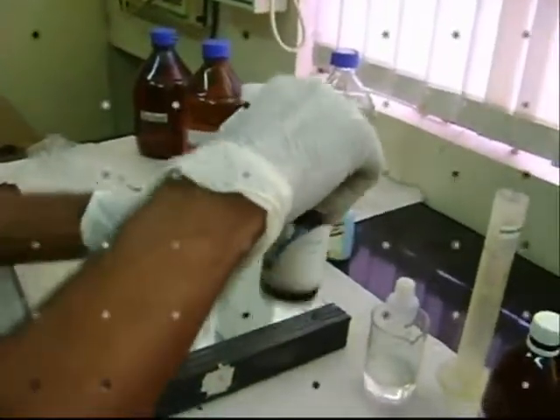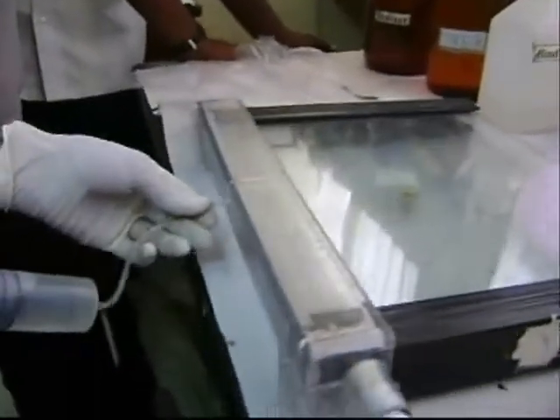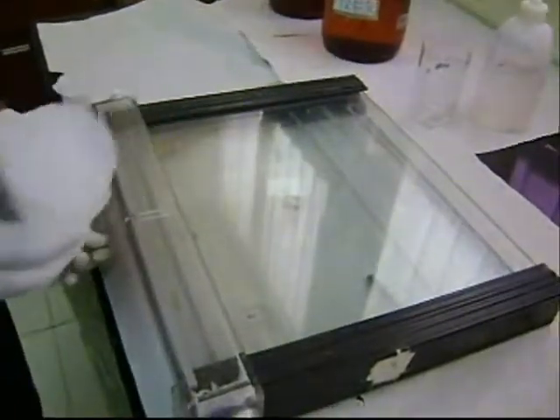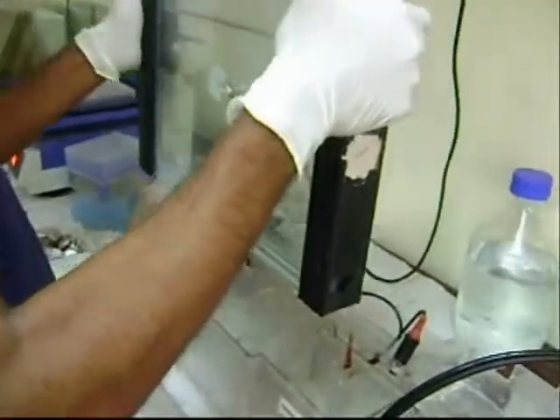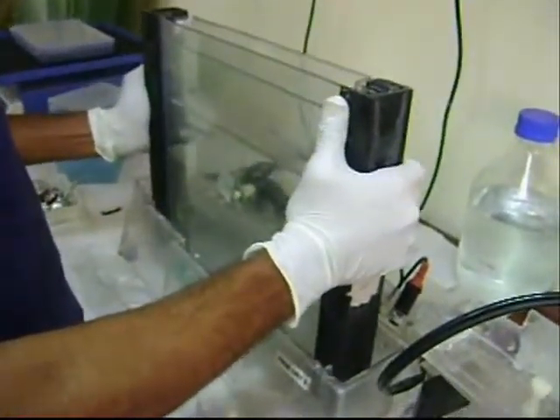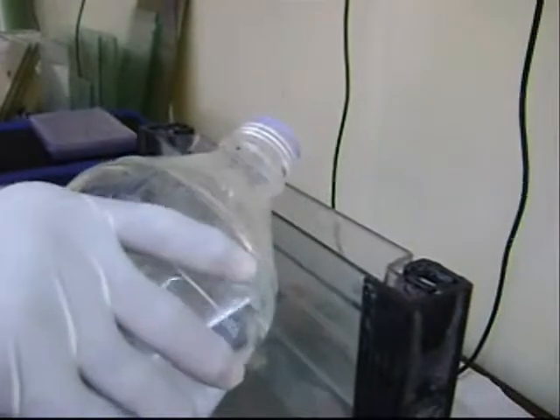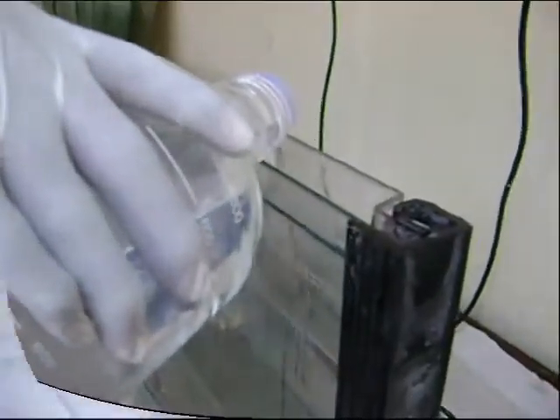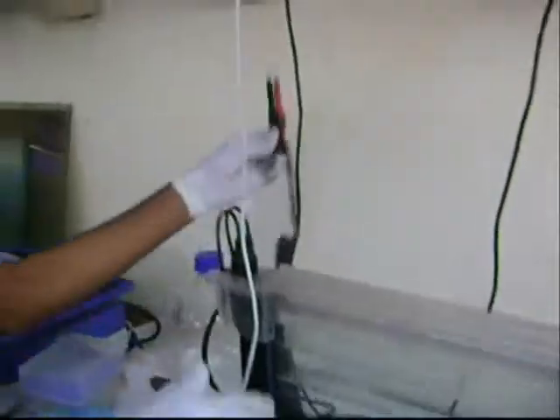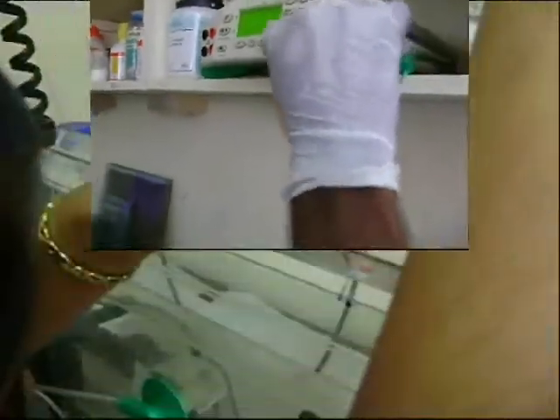The gel solution is injected between the plates using a syringe. The unit is kept for polymerization for 1 hour. After 1 hour, the bottom safety cover is fixed, 1x TBE buffer is poured, and the comb is removed. The samples are loaded with dye and the unit is run at 100 watts.